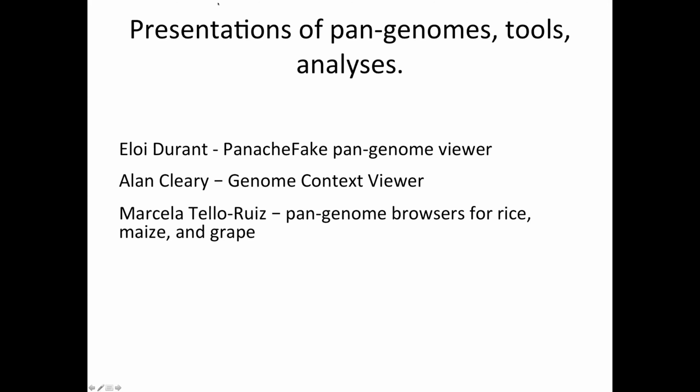Pankaj, are you talking about a single gene translocation or a segmental one? No, a portion of a chromosome just moves to a different chromosome. So maybe in one or two lines or subspecies or species, it moves to a different place compared to all your other genomes.